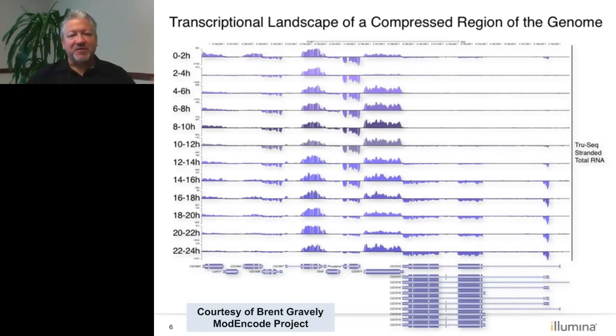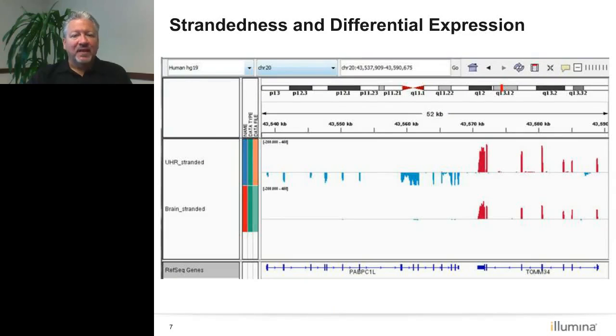And essentially you can picture this happening across the genome in any eukaryotic system as you perturb it. And that's what is really amazing about the resolution and insight you can get from RNA-Seq: you can really start to look at these dynamic expression changes in amazing detail.